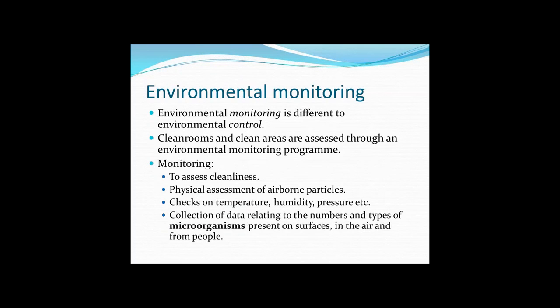So with the environmental monitoring, what we've discussed a lot is really about ways of environmental control, but we also need to continually assess the effectiveness of our cleaning and disinfection regimes. And a lot of this is based on the environmental monitoring.